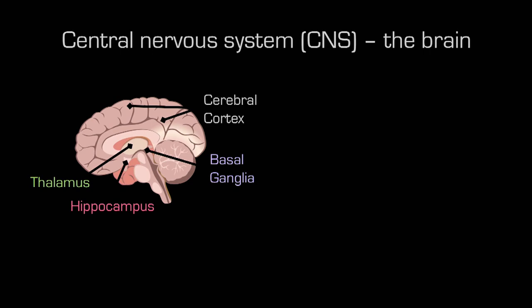And they don't just do their own job, they also communicate with each other and coordinate. So wow, this is really complicated. How can we hope to capture this or model it on a chip? Chris kind of talked about the same question in introducing the whole human in a box or human on a chip. It's very complicated, many organ systems that we might want to include in the future. Maybe you guys will be working on that someday. But for now, our first step is to take a subset, a few different subsystems that we have an understanding about how they work together, and put that on the chip.